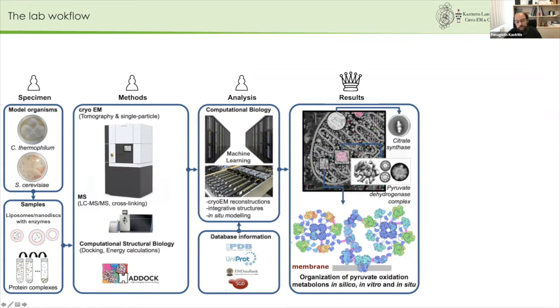And by using external database information, we integrate all of this data into our analysis pipeline, into which in 2022 we have started to integrate artificial intelligence also in order to get to our results, which is basically trying to understand how proteins form this kind of complexes and then higher order assemblies and how they look like, what is their architecture.